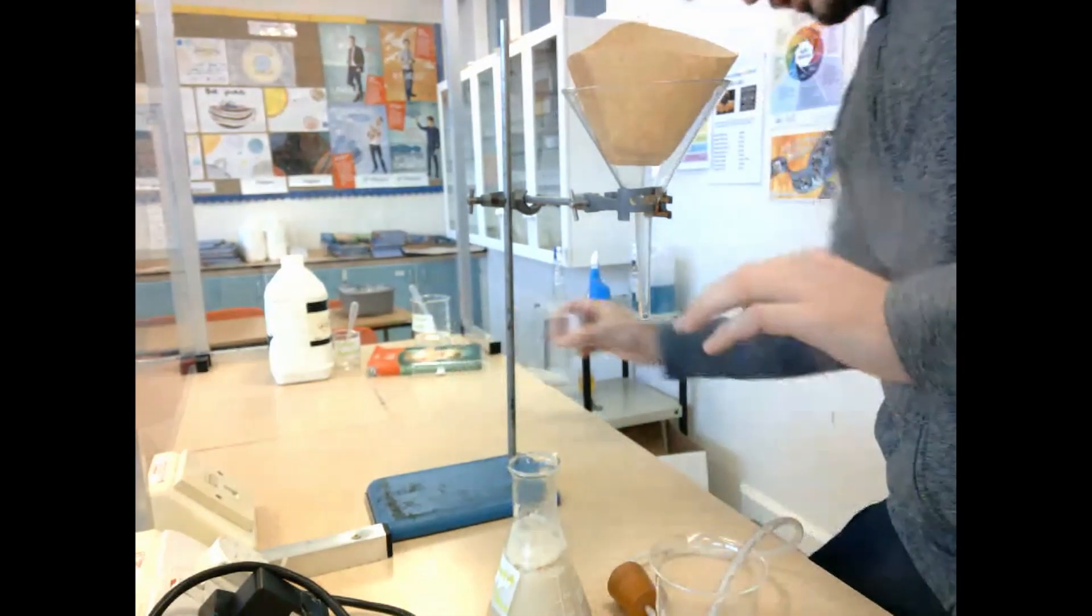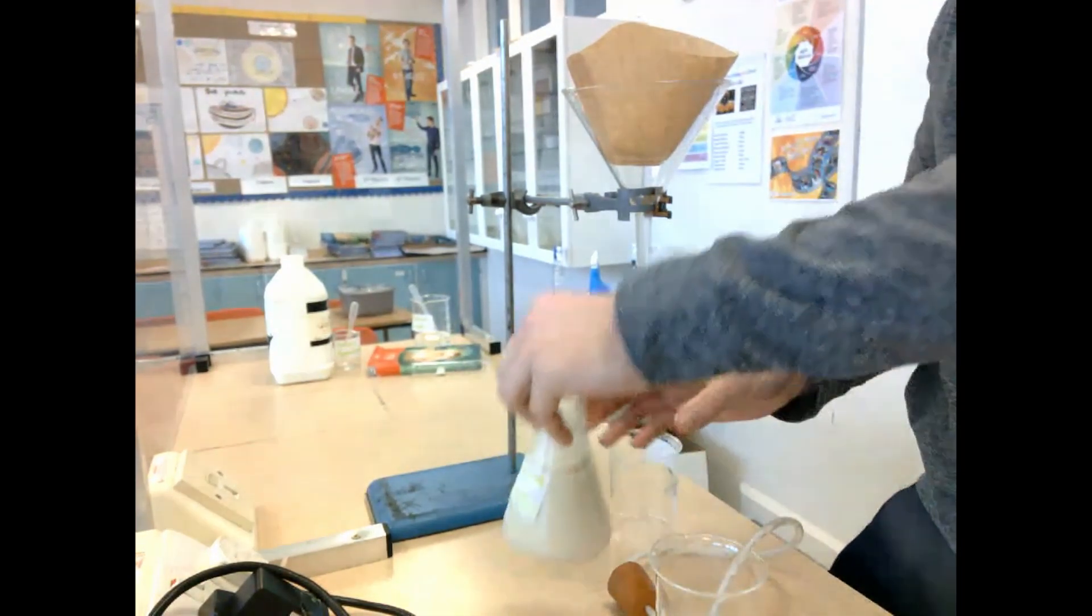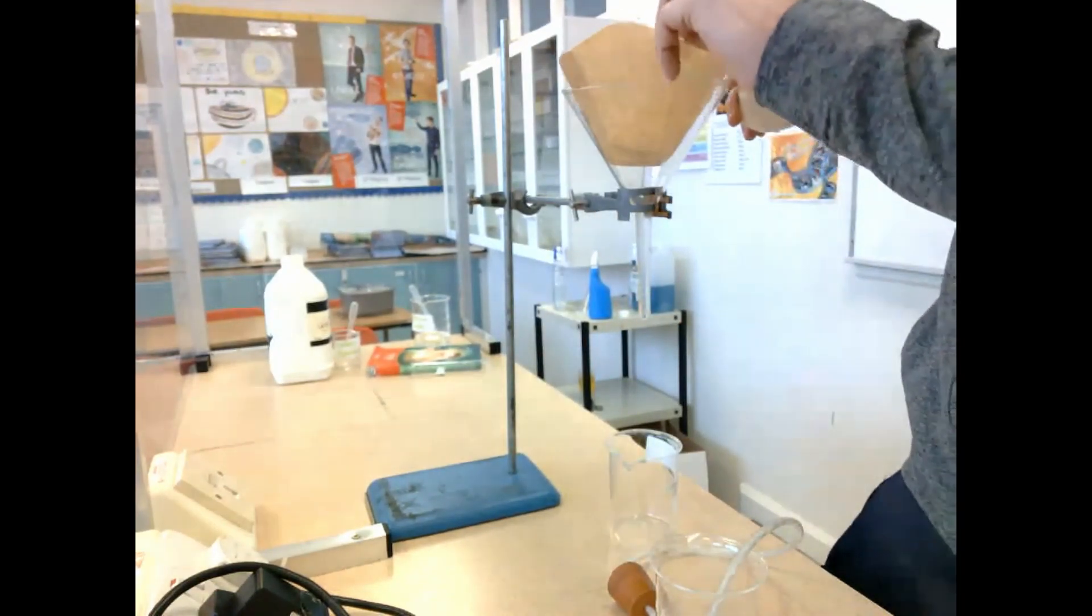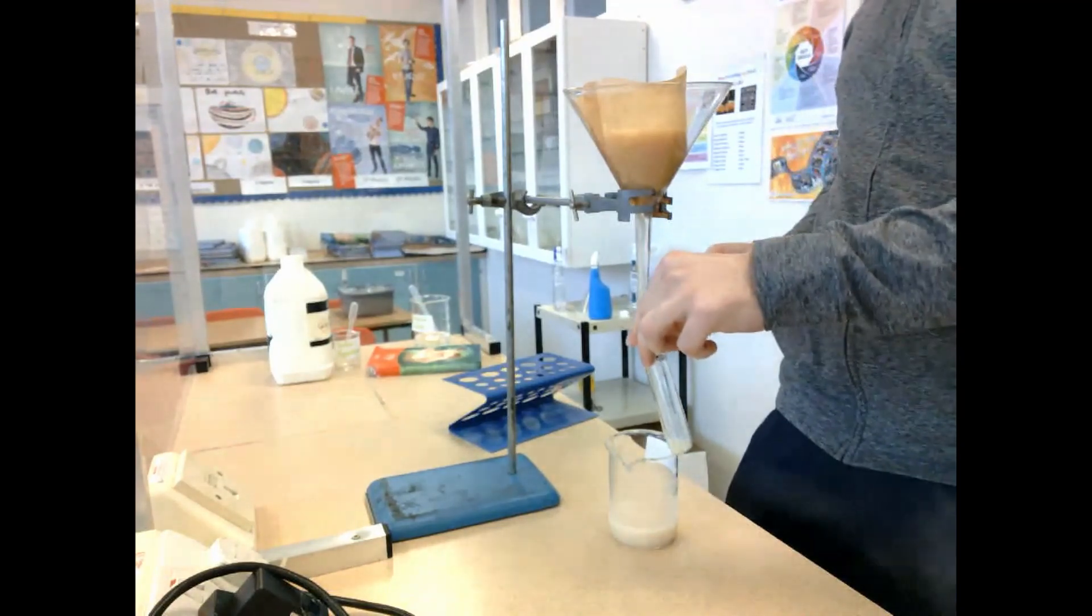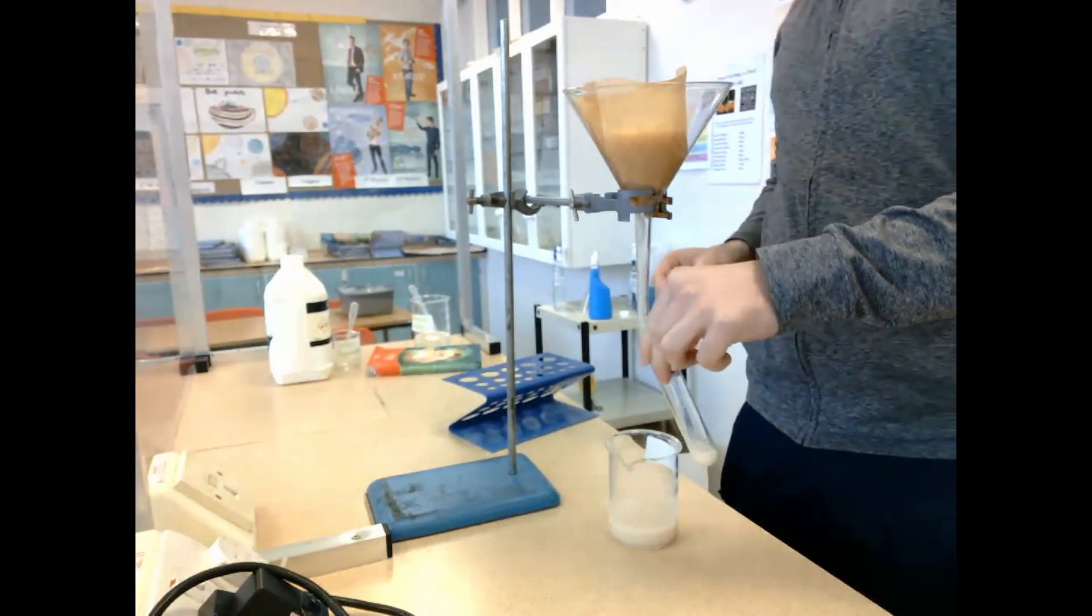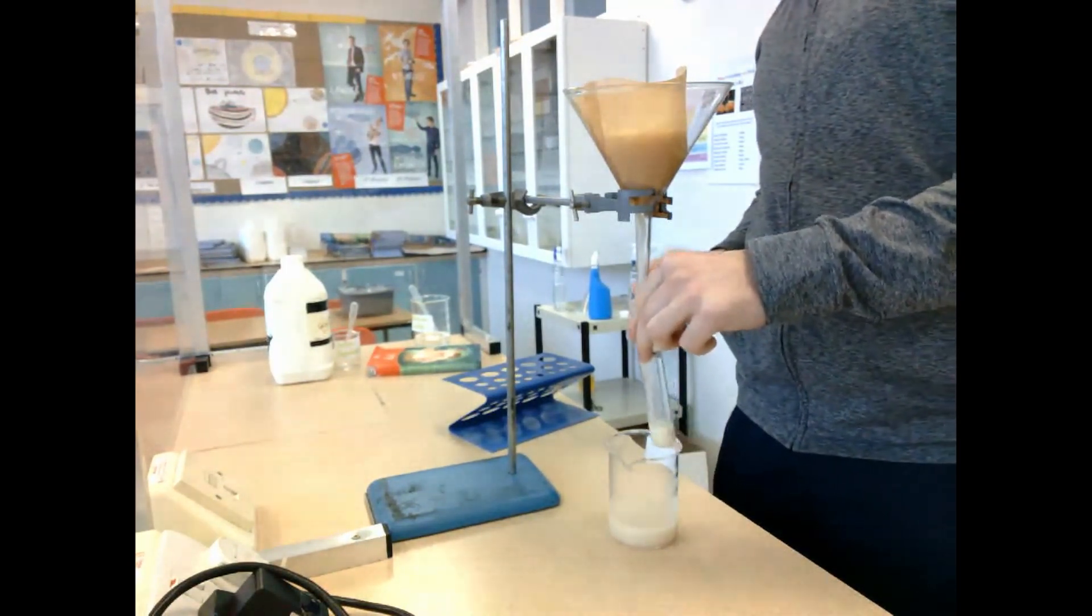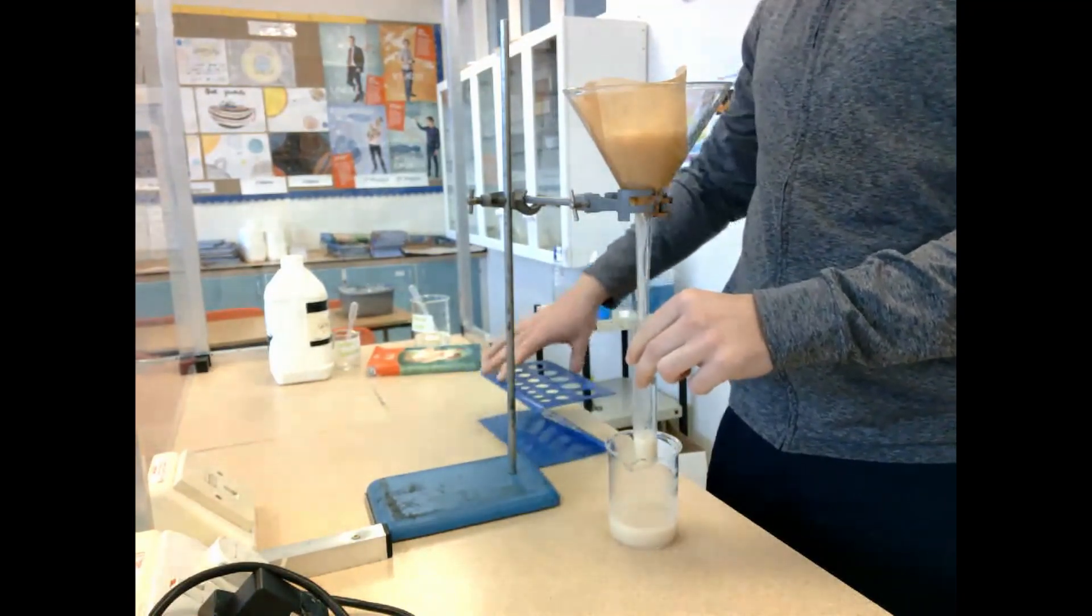Now the next step is let's see if ethanol was also being produced. To do this, we have to filter the solution. We take our conical flask and add it to the coffee filter paper, and this will remove any solid mass within the solution.